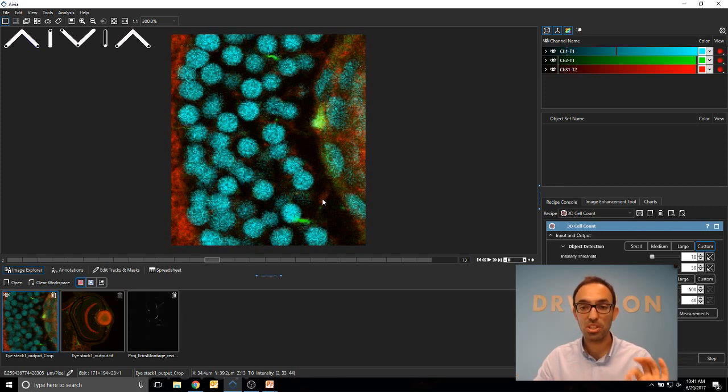And I'm particularly interested in channel 1. So in this location, intensity is 2 in the background, and inside the nuclei, it's around 89. But what really matters is on the transition, so on the beginning of that curve, and it's around 10 or so. That's why we have 10 there.